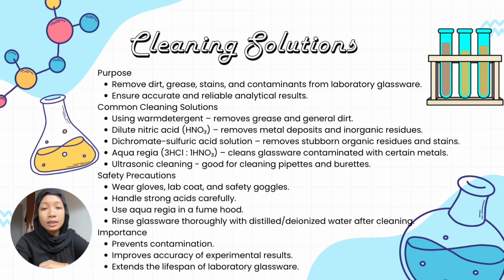First, detergent solutions are used to remove grease and general dirt. Second, we use dilute nitric acid. Dilute nitric acid is used to remove metal deposits and inorganic residues. Third, dichromate sulfuric acid solution is used because it is effective for removing stubborn organic residues and stains.